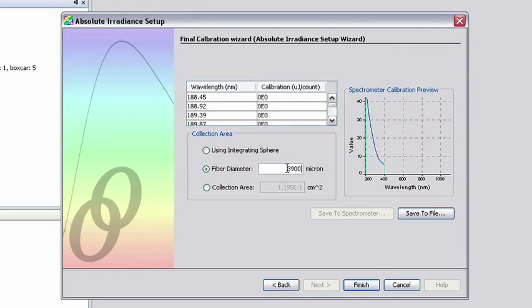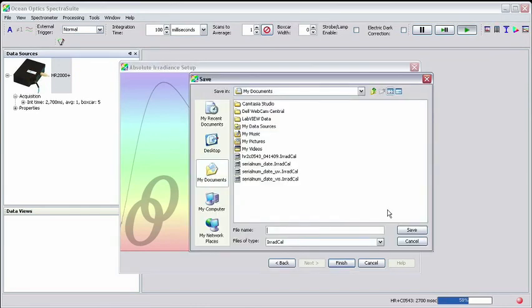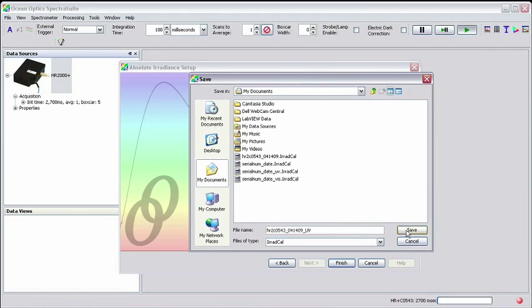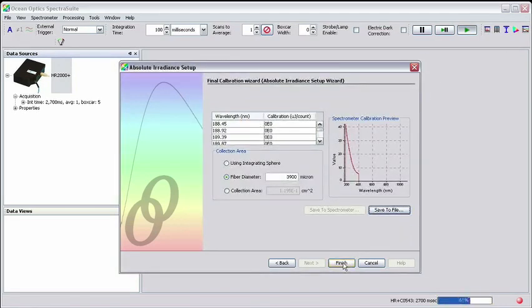Spectra Suite generates a calibration file for your spectrometer at the end of the Absolute Irradiance Wizard. To save this file for future use, simply click the Save to File button, give the file a name of your choosing, and save it in a location of your choice. Clicking Finish brings you back to the main Spectra Suite window.